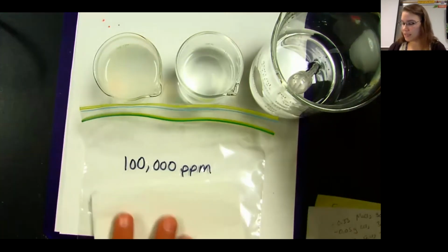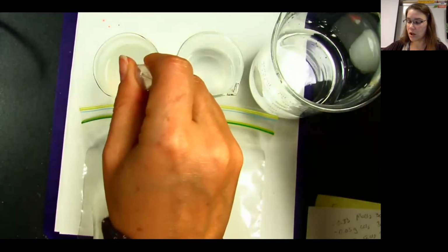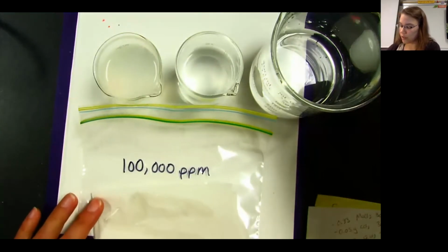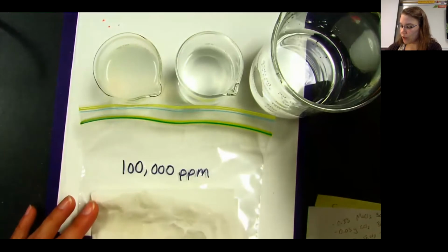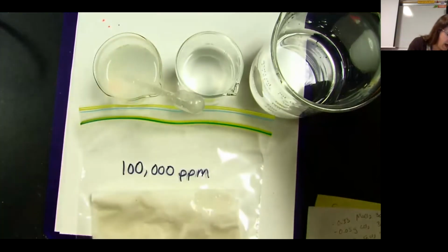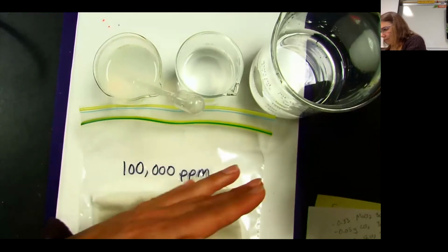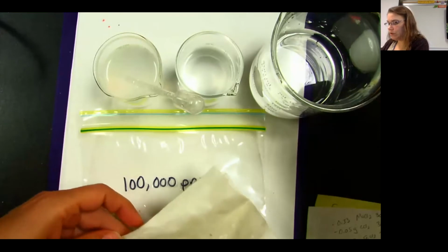But this time, instead of using water, I'm going to use my really salty solution, my 100,000 parts per million. I'm going to get it a little wet so that the seeds stick and don't fall all over the place. And then I'm going to add my 10 seeds. I'm going to put this into the baggie.